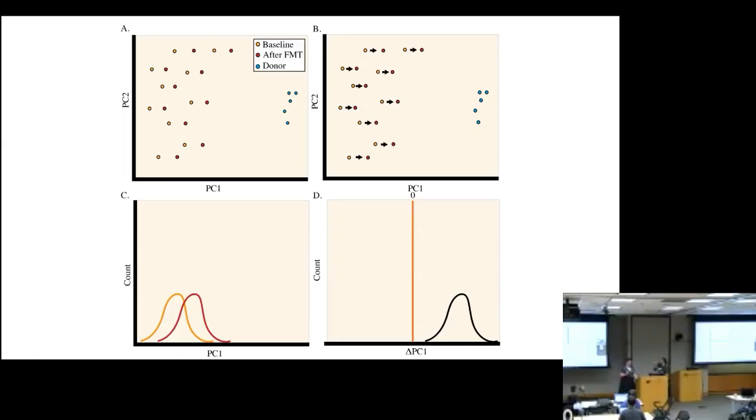And so we see a lot of ordinations that look like that one on the top right, and people get discouraged and think there's no pattern. But it's really because the ordination is this initial exploratory tool. And there's a lot more to your microbiome data than that initial ordination that you're looking at.